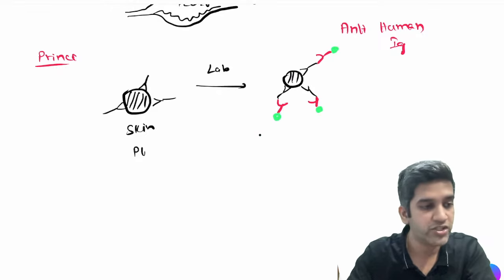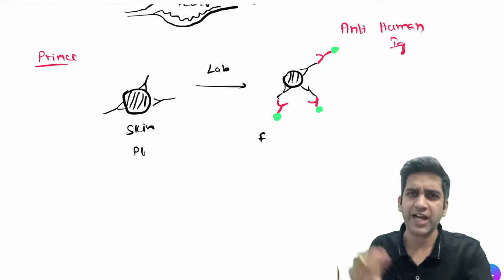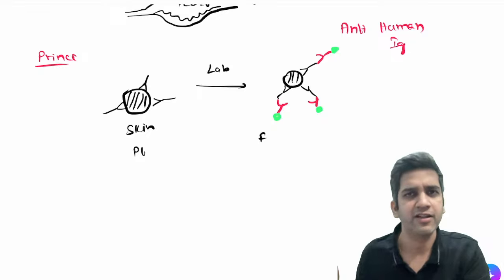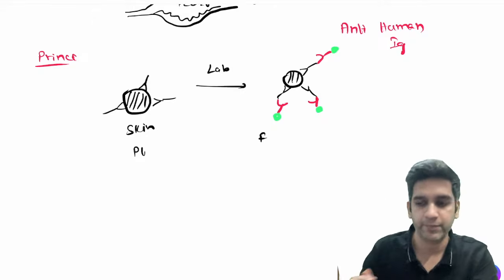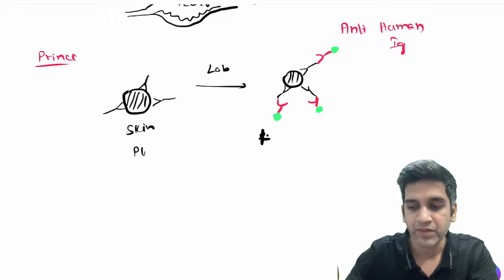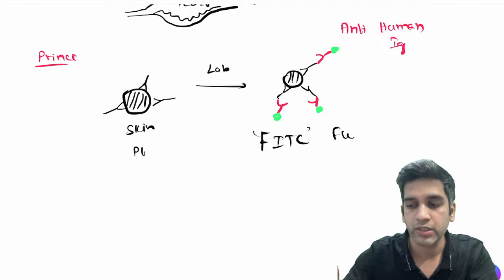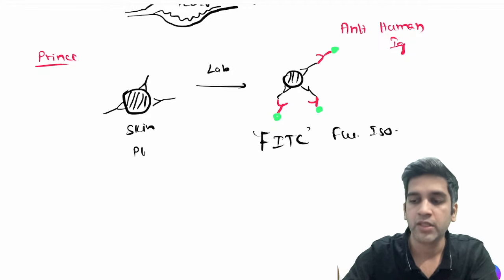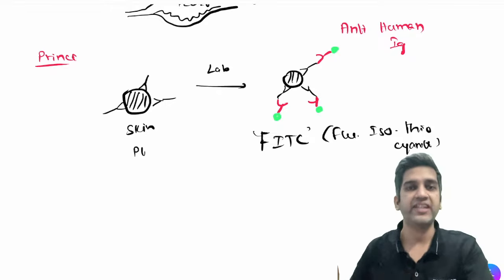This dye has also come in the question. Yes, antibodies for antibodies: immunoglobulin is also a protein, right? Obviously, to any protein I can create an antibody. So I create that in the lab and I keep it. So I have a green color dye. This dye also came once in the exam. We call it FITC, fluorescein isothiocyanate.